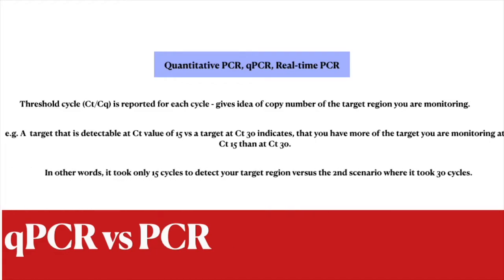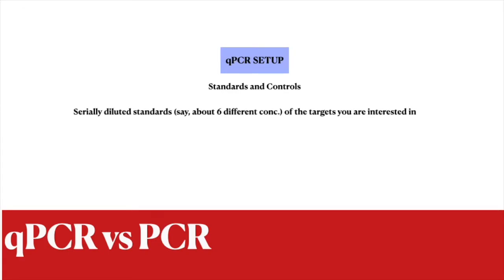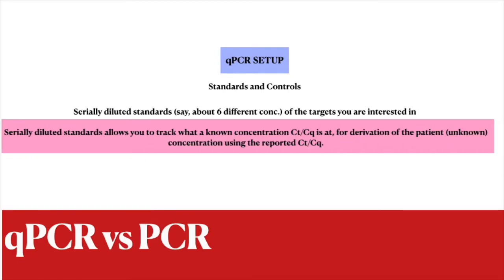In practical terms in the lab, when you're trying to determine how much of a virus is there, you will have a standard curve. You have standards that you use to create a standard curve. Standards are essentially control samples in the sense that you know how much of the virus is present in each point of the sample that you're using to form a standard curve, because you design it, and it helps you quantify how much, for example, the 15 cycle detection equates to in terms of quantity of virus. So I hope that you appreciate that you're able to comment on how much virus there is only because you have a sample with known amounts of virus. And so if you compare your 15 cycle detector with your standard where you know how much virus was there, then you can make inferences, you can comment on how much virus there will be in a 15 cycle detecting sample.